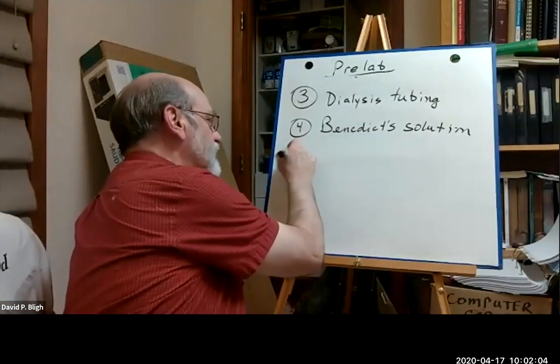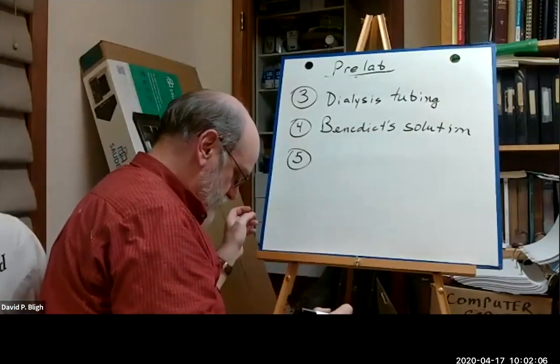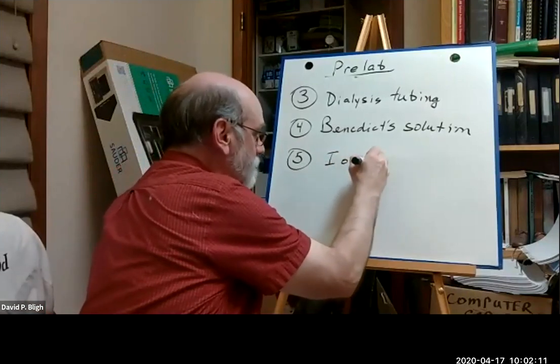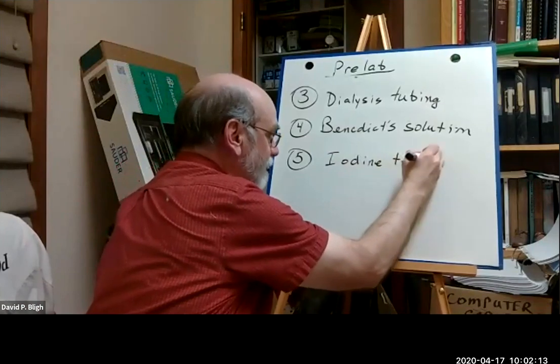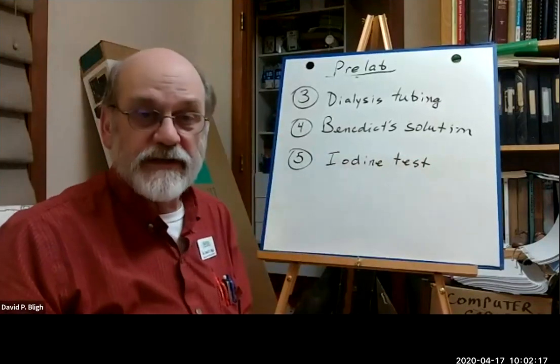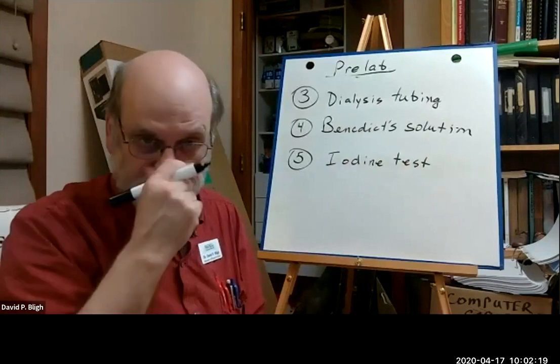Now, what's the purpose of the iodine test? The iodine test is used to detect the presence of starch.